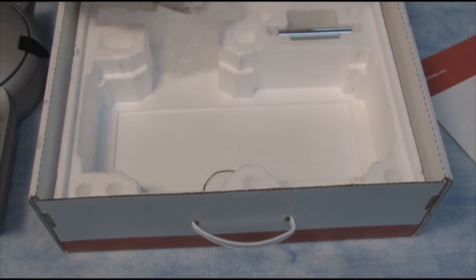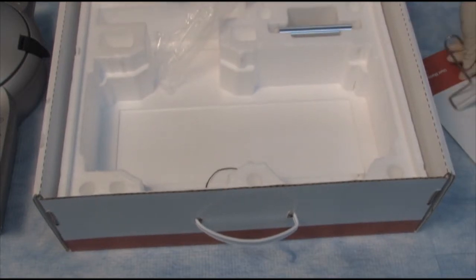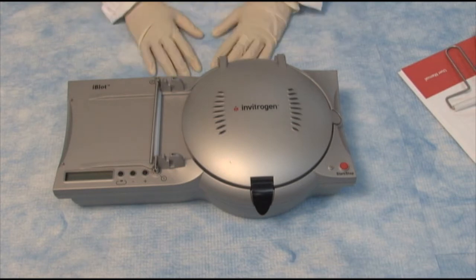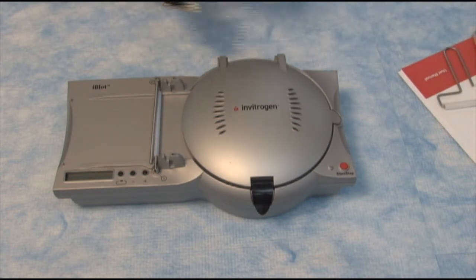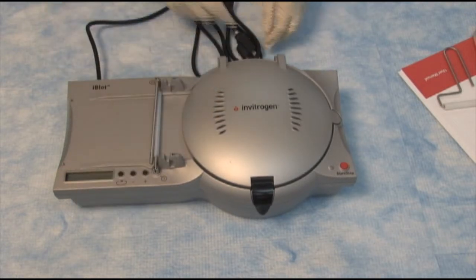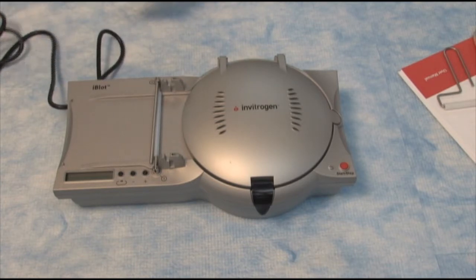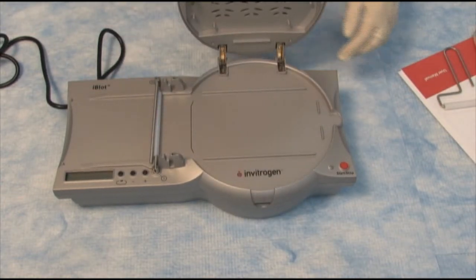This is a USB cable for uploading firmware, and we have a roller for removing air bubbles. This is the iBlot device. Here's the lid.